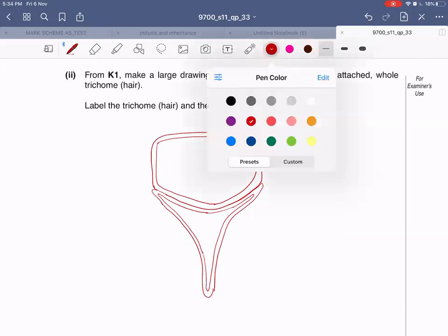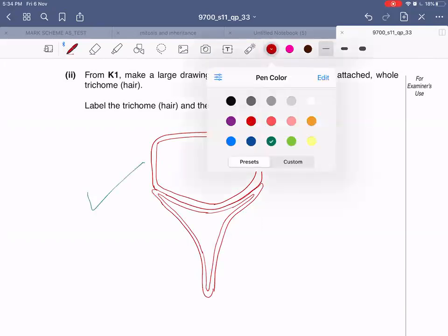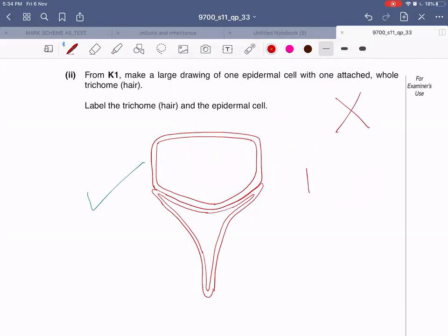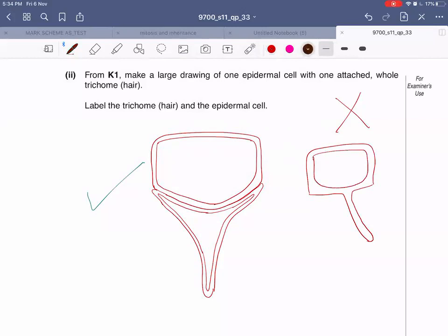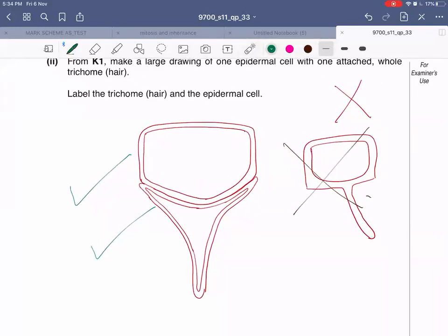This is the correct method to draw. I'll also show you a wrong method so that you know what not to do - this is the wrong way to draw a trichome with an epidermal cell. Do not draw it in this manner. You will draw it correctly and then label it: this is your trichome hair, and this is your epidermal cell.